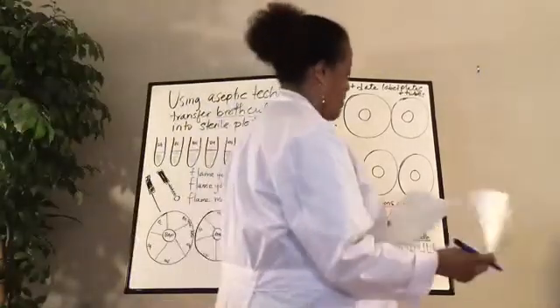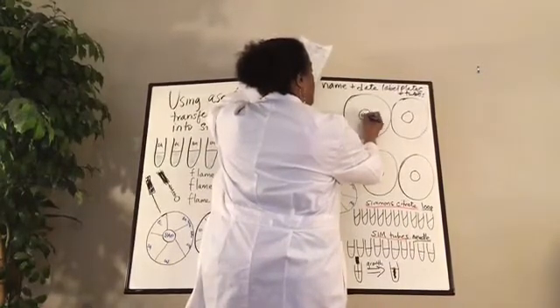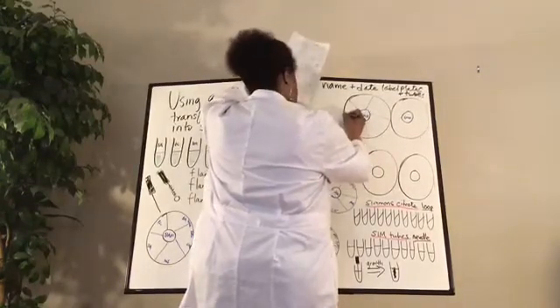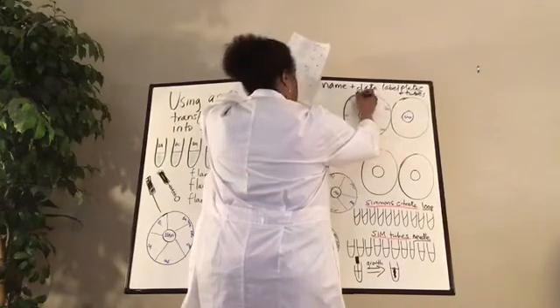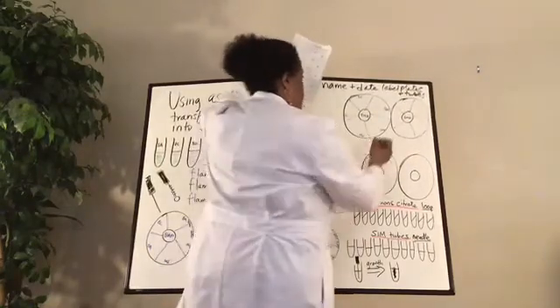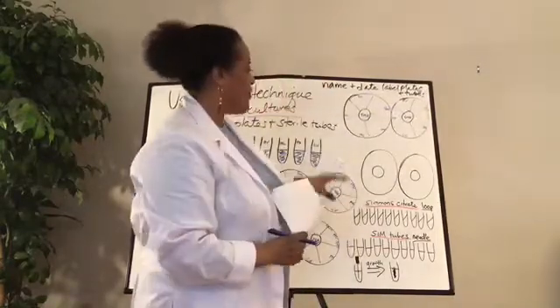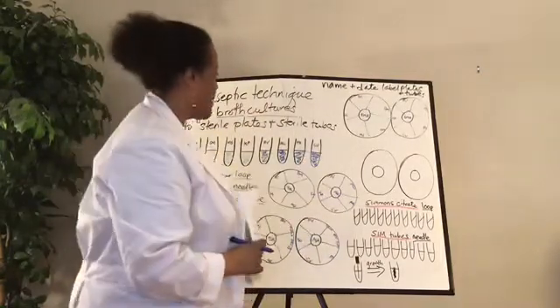Let's go over to the EMB plate. This is EMB agar, and we have to load it up with the SA, MS, SM, BM, and the EC, same. And then this one, KP here, CV, PA, ML, PV. So all of them are labeled exactly the same, but you know that these are all 5 different agars, right? And then let's do the last one.